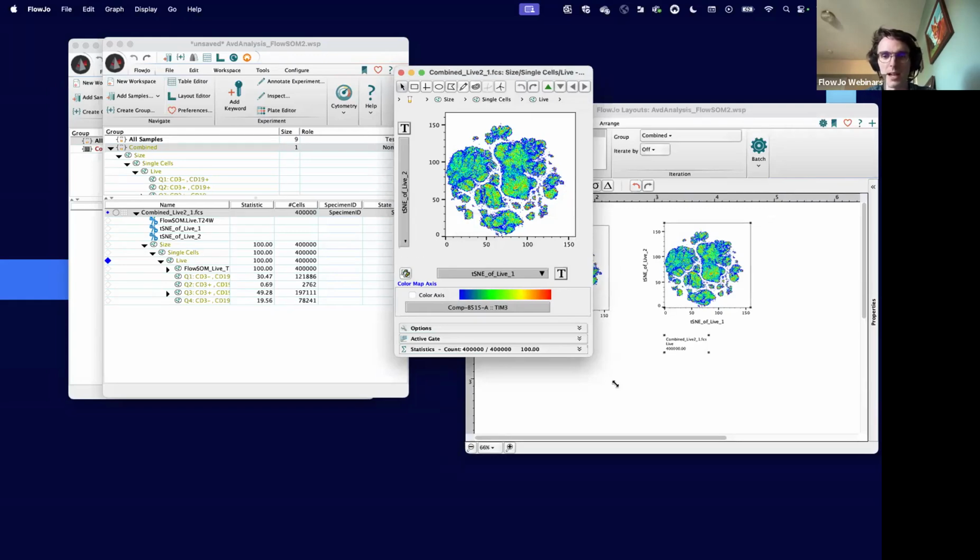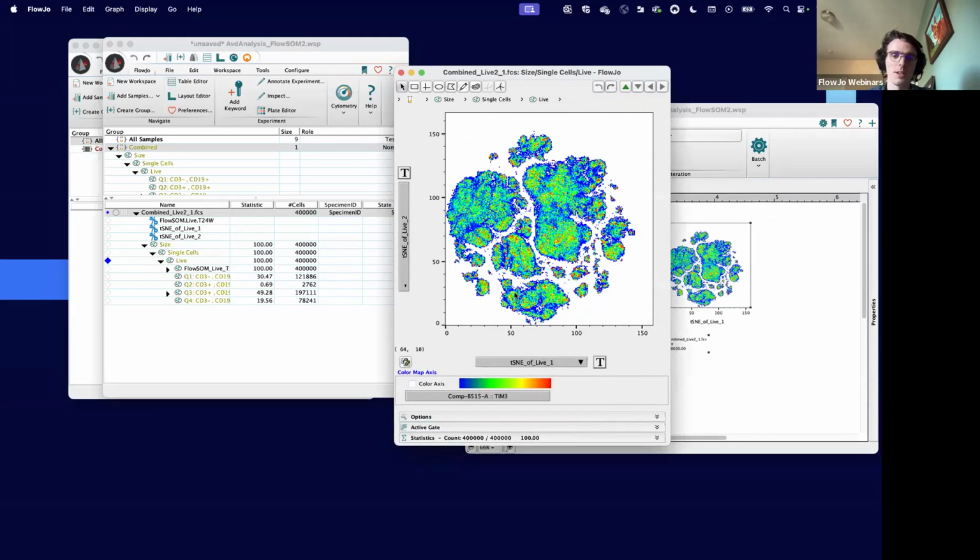But we can look at the graph window for a second here, just look at the results. You can see it's grouped my data together based off the marker expression, and hopefully it's grouped it into our different phenotypes of interest. We can count the number of islands we see here as a good starting place for getting an idea of the number of clusters we might expect FlowSOM to return.